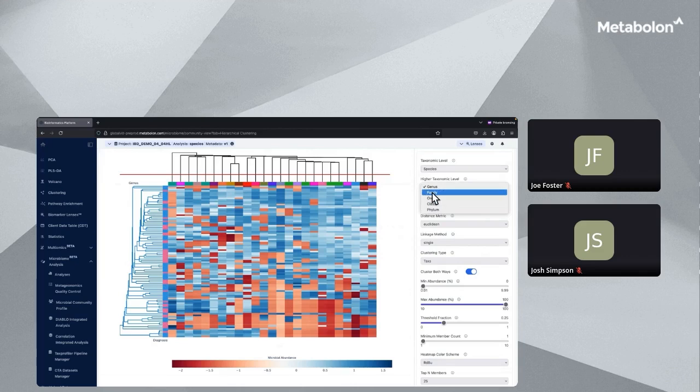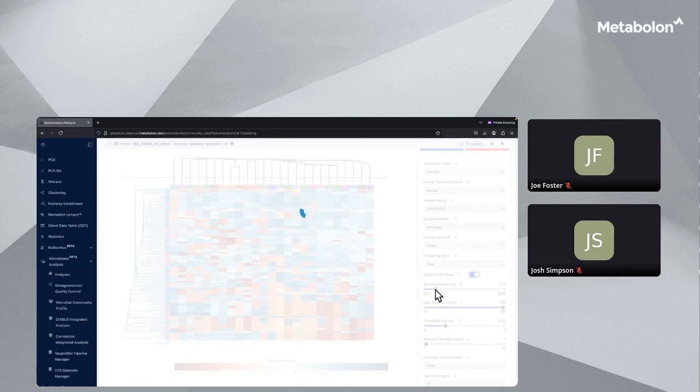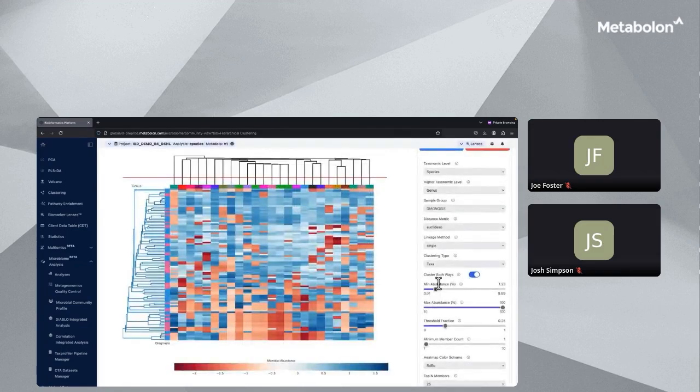The dendrograms and heat maps together provide detailed insights into sample similarity and the relative abundance of individual taxa across samples. Based on the study variables indicated in pink and blue on the y-axis on the left of the plot, we can begin to identify areas where the samples cluster together and areas where samples diverge the most in terms of taxonomic composition. As with the other screens, we have several parameters we can use to reformat the information shown in the plot based on our observations across the other screens.